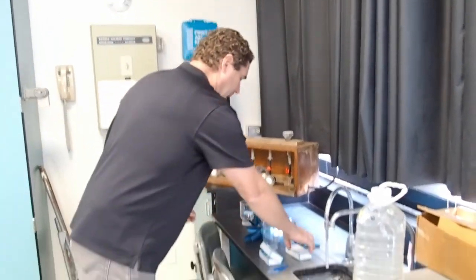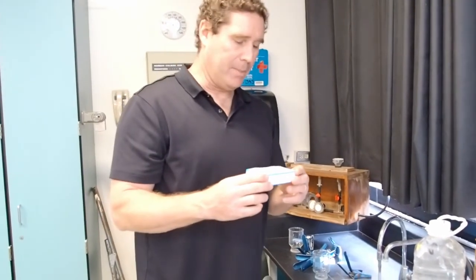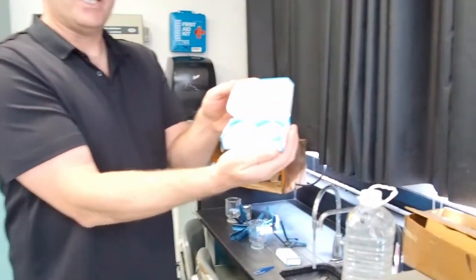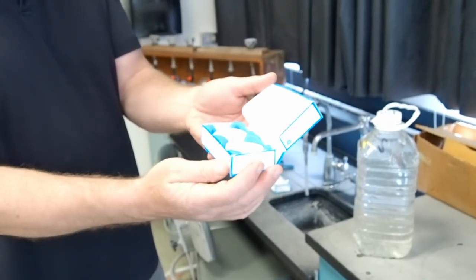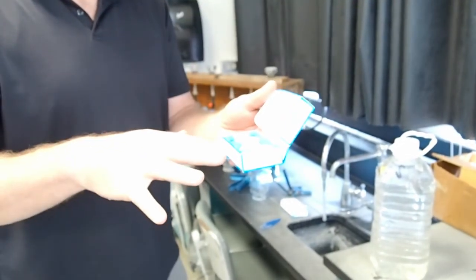So here we have our filters. These are Whatman glass microfiber filters. So they're basically small discs of glass fiber. They look like paper, but they're actually glass fibers. And they're very porous, and they trap very small particles down to several microns as the water is able to flow through these filters.